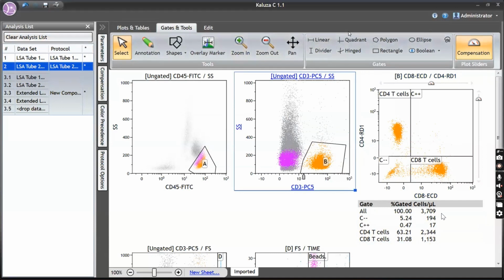Please download Kaluza, just to give you a hands-on experience. Those who have Kaluza or other software, it's fine. Those who have not yet checked the software, please download the trial version. I'll give you some files to play with. You just work on it. You have a feel of it. You'll enjoy it really. There may be some difficulty downloading it. Once you have downloaded it, the trial version exists for 1 month. So in that 1 month, you just play with some cases.